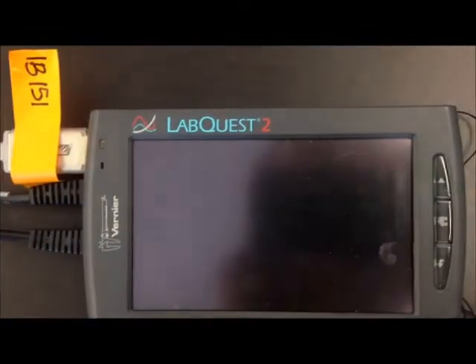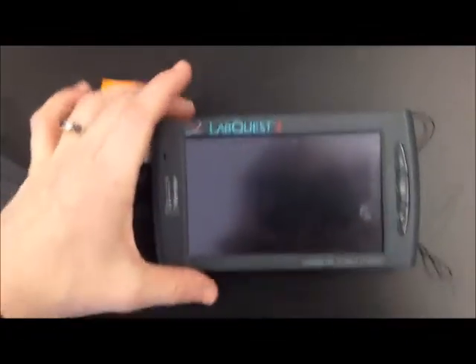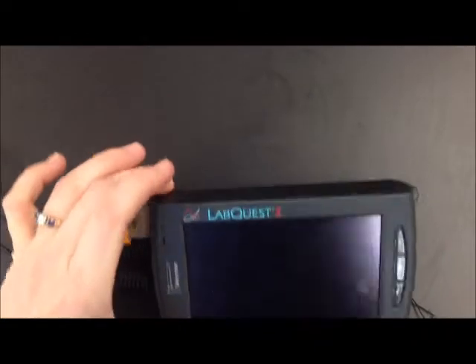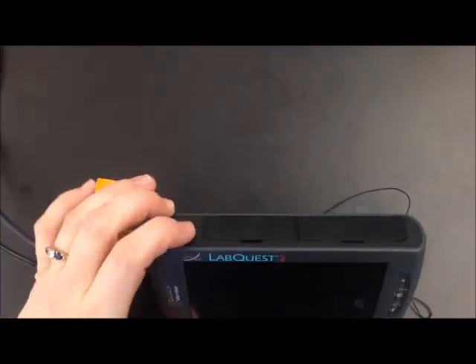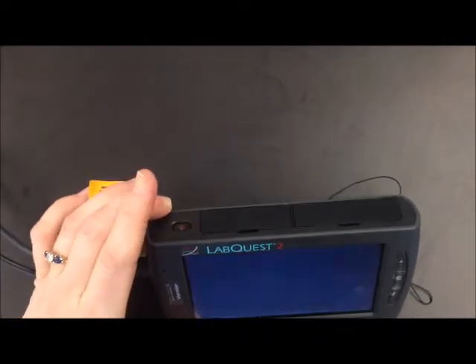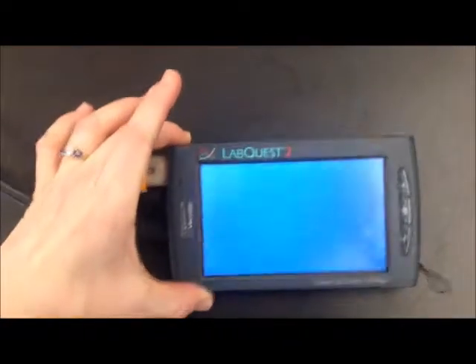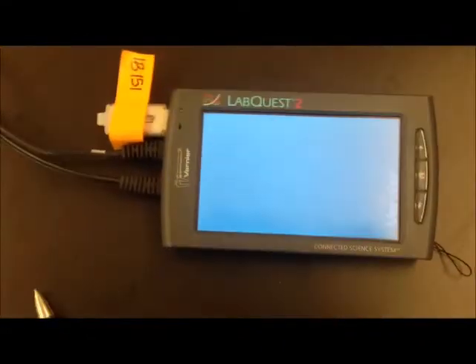For now I want to tell you how to use this software. First of all you're going to need to turn it on. The on button is right here — just press that and it will come to life.